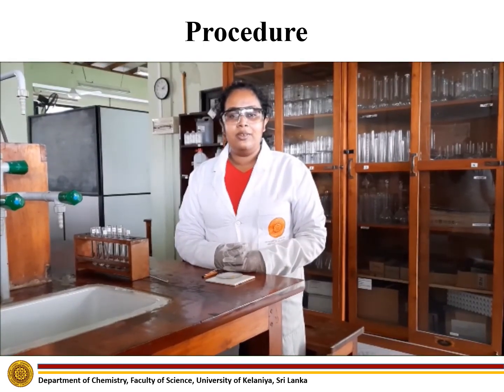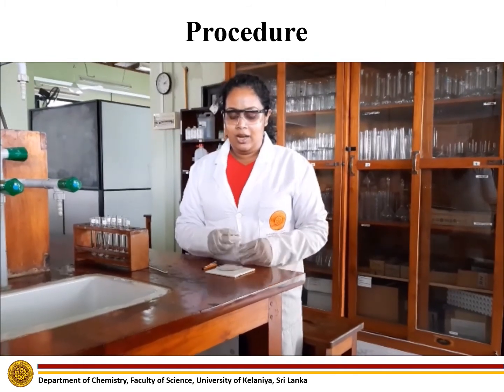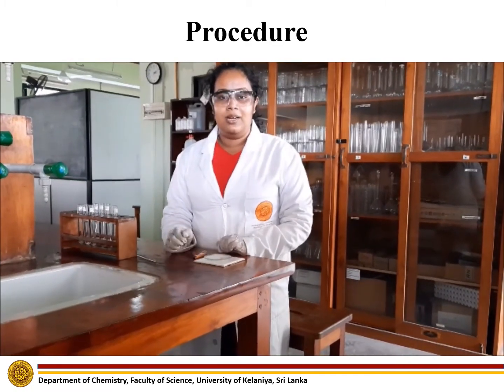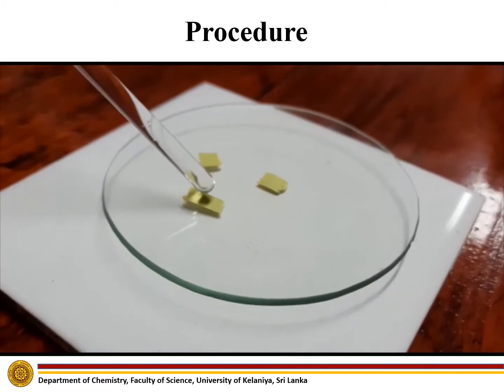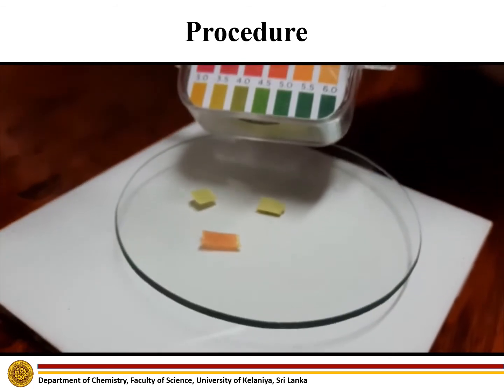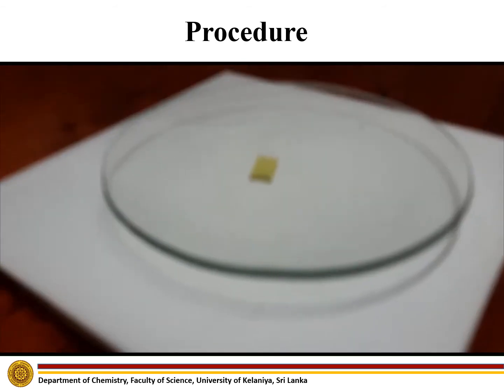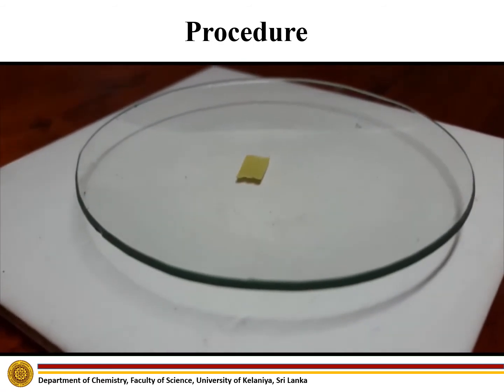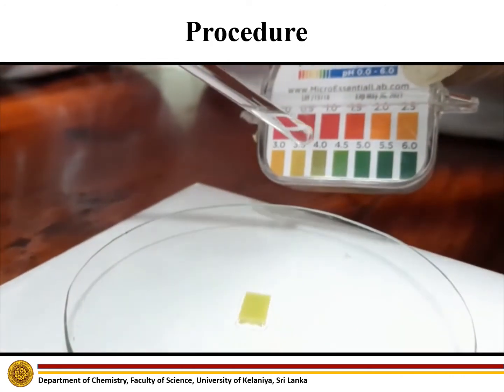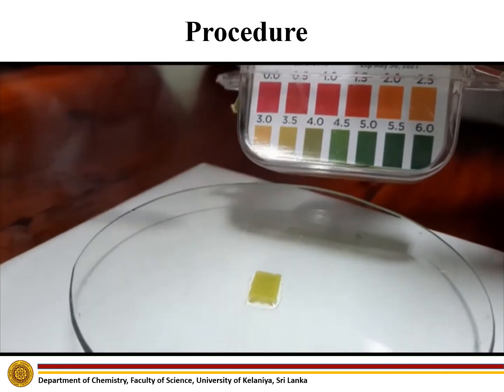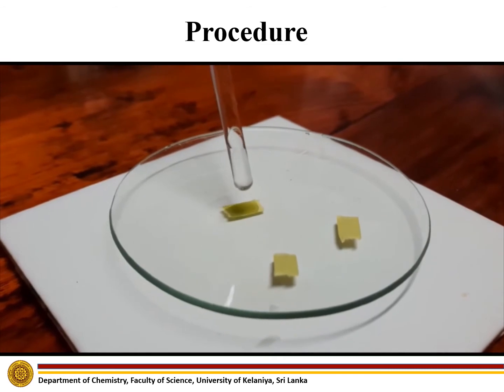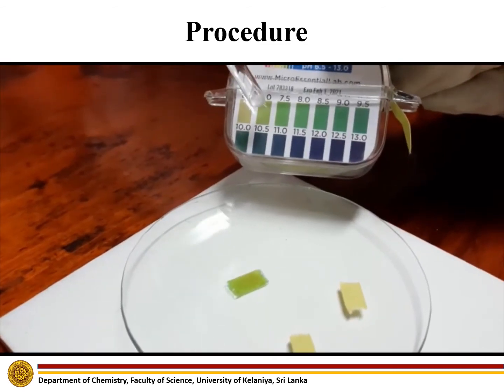To check the pH of the salt solutions, place the watch glass on a white tile and place some pH papers on the watch glass. The pH value of aluminium chloride is approximately equal to 2. Next, let's check the pH of zinc chloride salt — it is approximately 4.